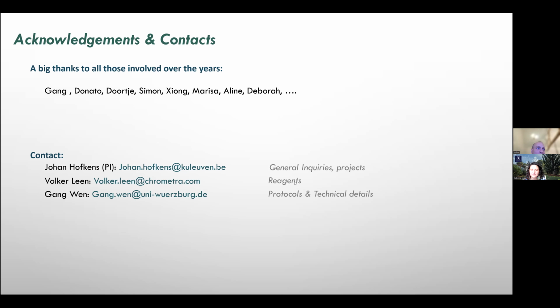You could tag them through thiols, or you can tag them through amines. We also have post-staining methods for proteins. Not all of them were shown in the talk. And the reagents are available from us for research use and testing, but also commercially available. I must say that Australia is quite peculiar to ship samples and reagents to, with its customs, but we have done so, so that's no big issue. If you're interested in something in particular, do reach out to us.